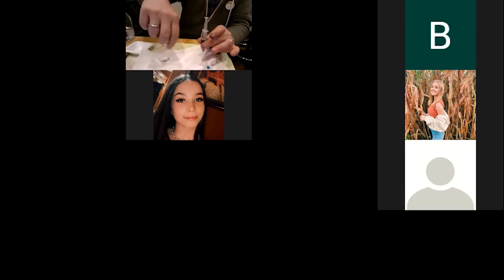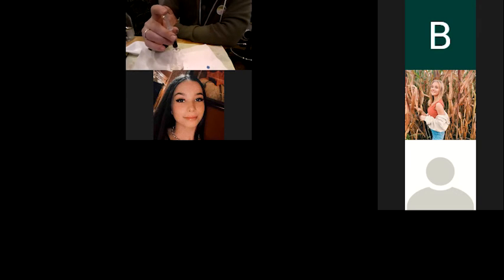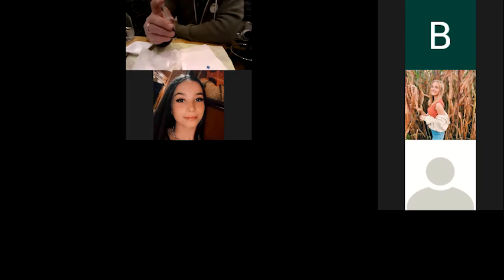A little bit on the side, make sure I get all that in there. Yep, so I'm still not there yet. And after your first titration, you'll have a pretty good idea of how much volume it will take. So once I've done my 2 mils, and the next one I do is the 1.5, I'll know it should take approximately 75% of the same volume, right?